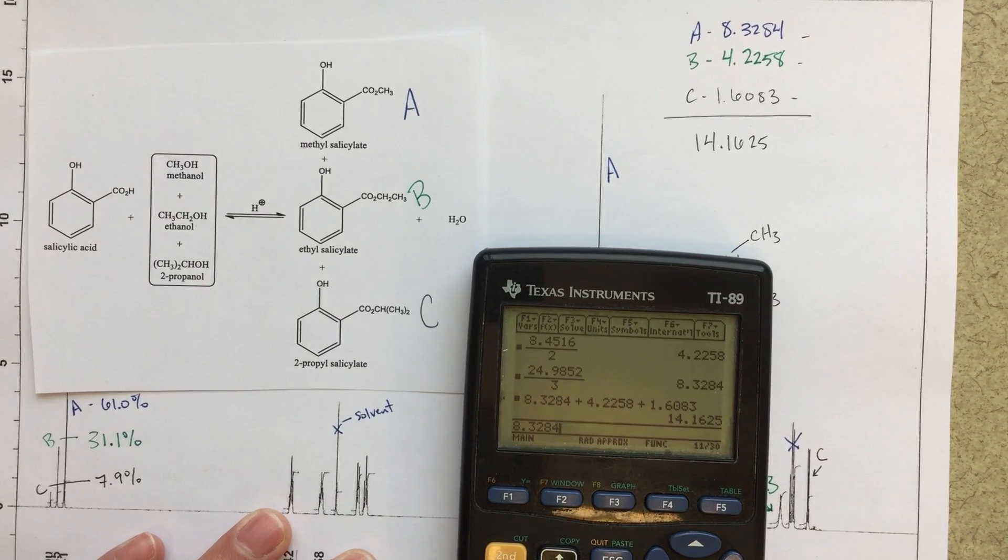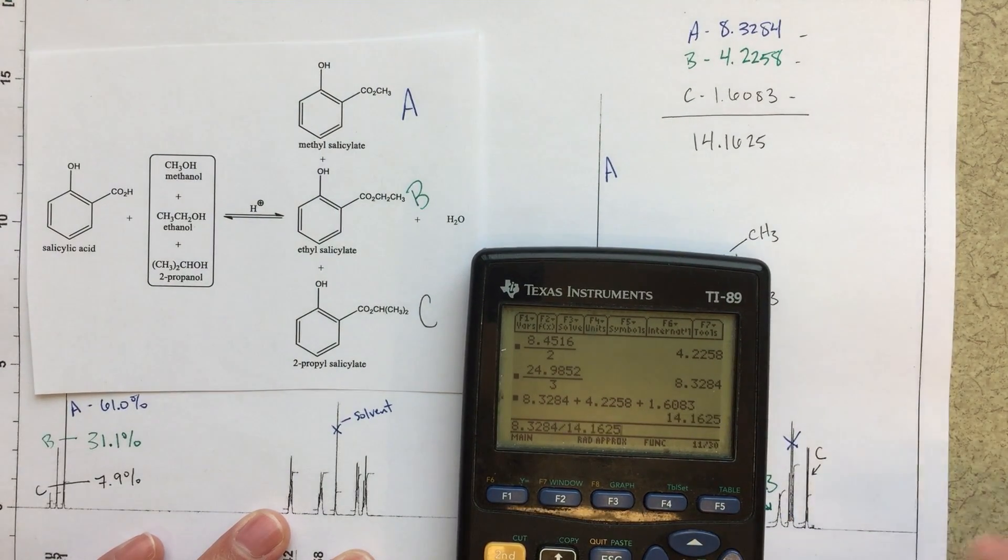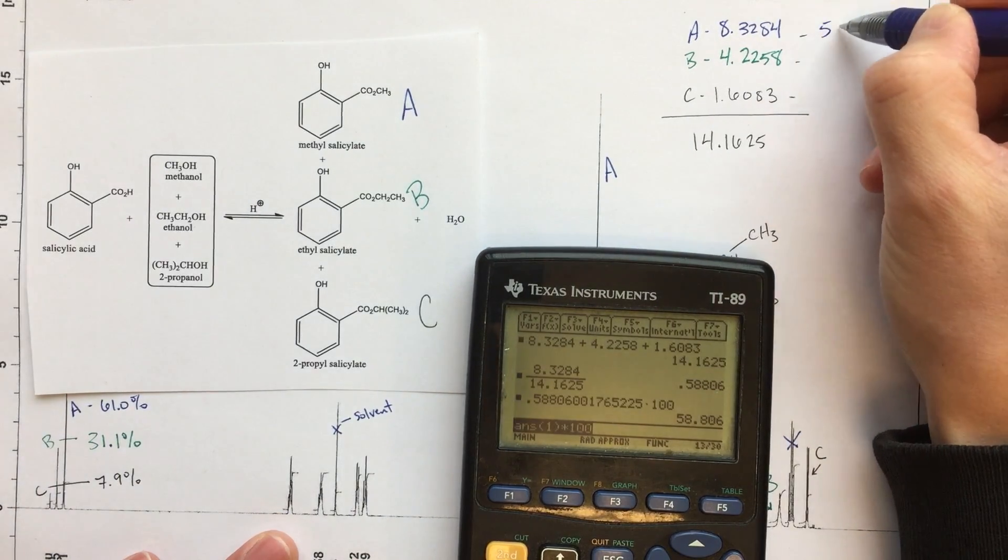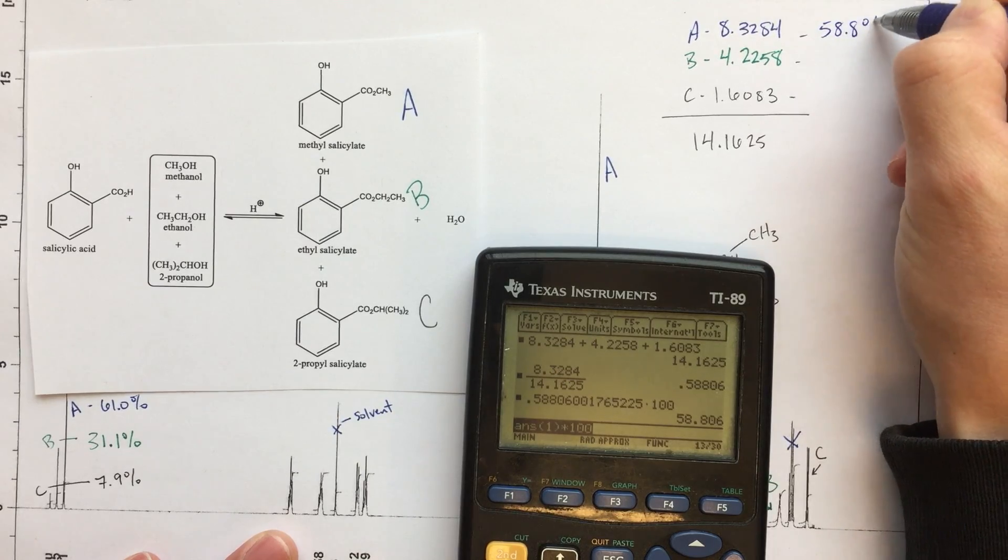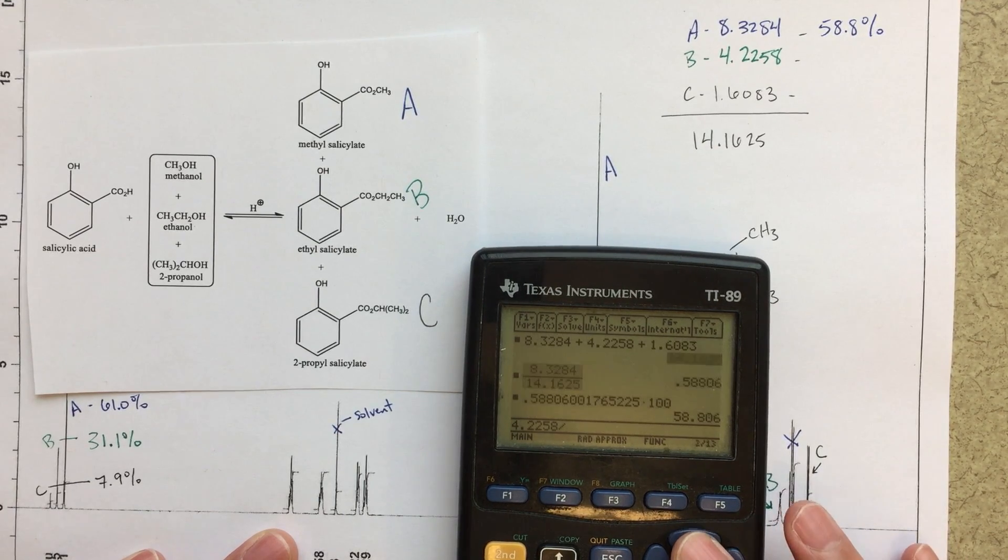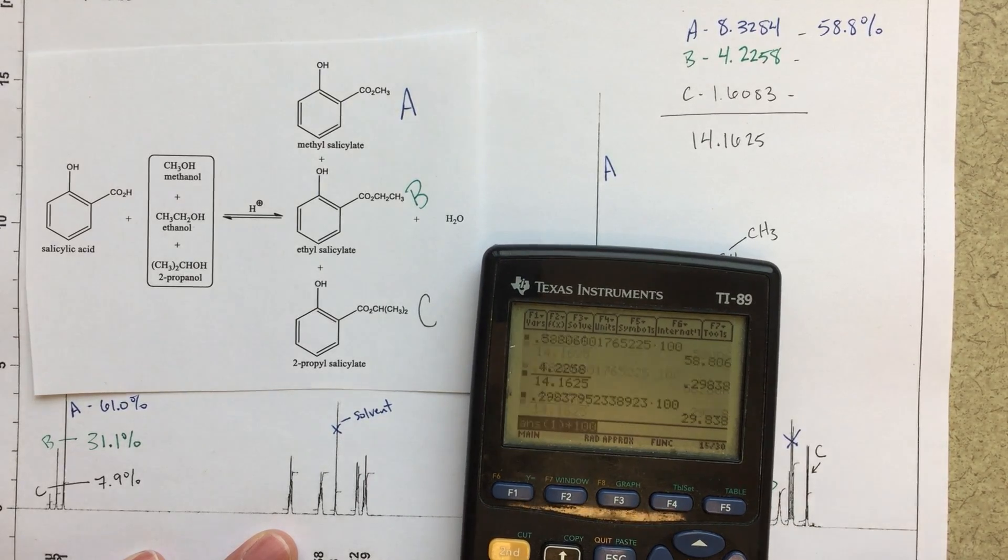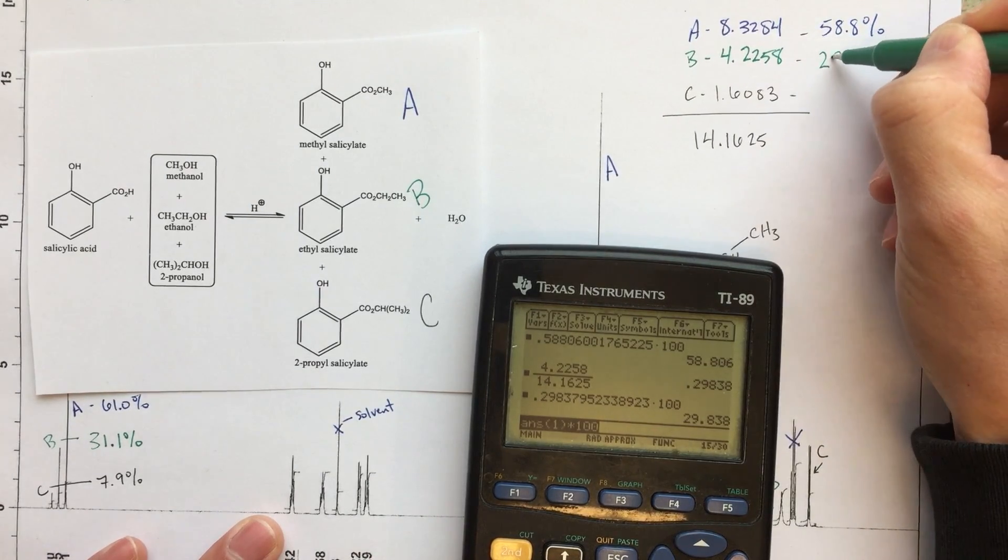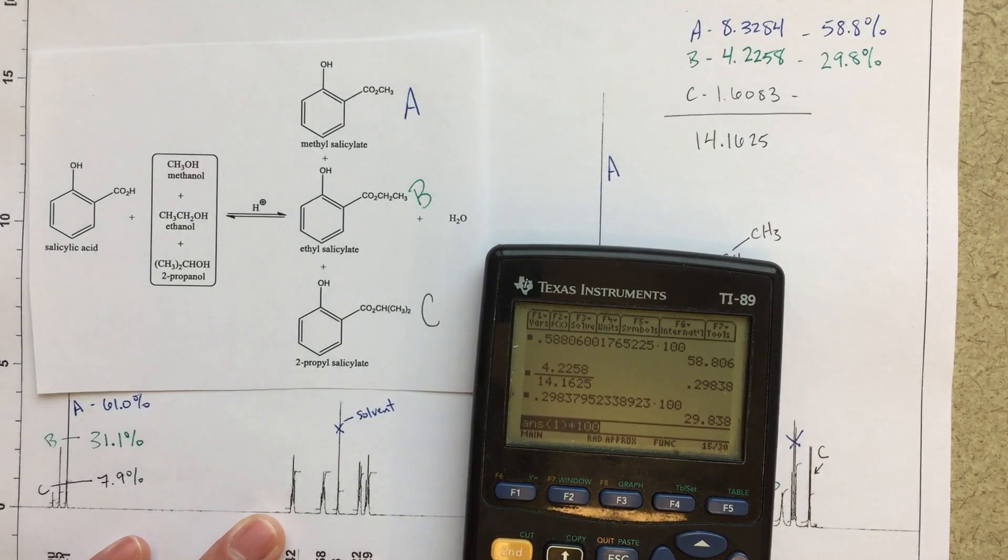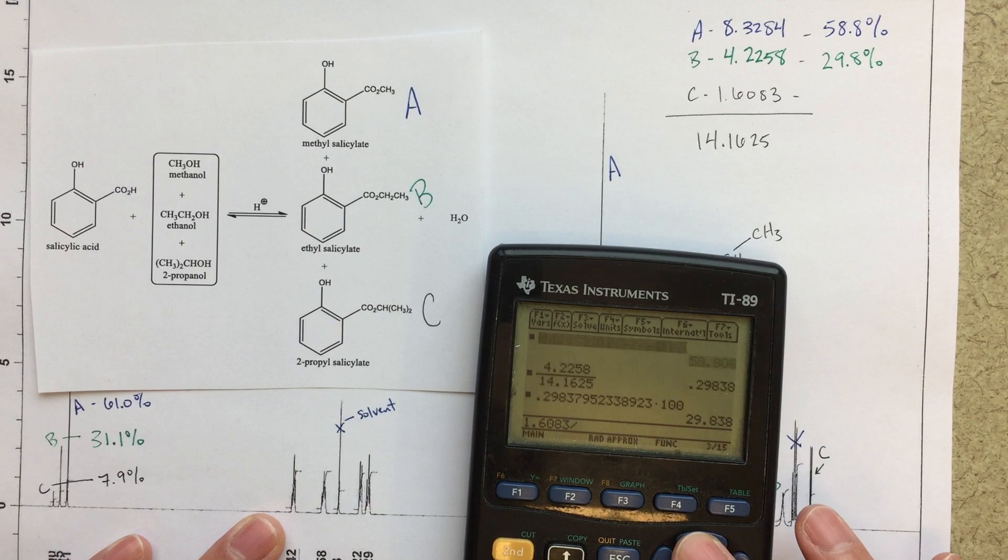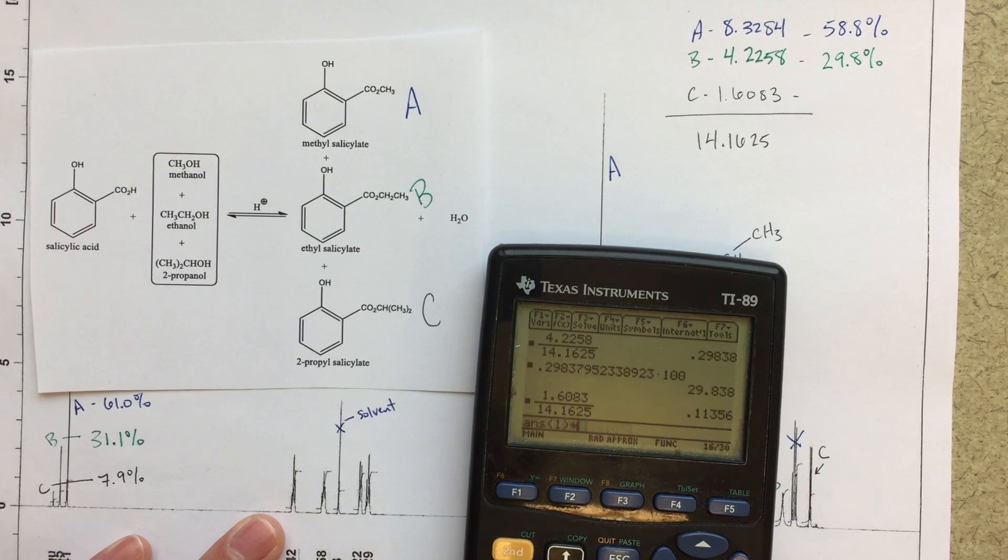So 8.3284 divided by the total, multiplied by 100. And these should be very close to what we saw before, 58.8%. We'll do the 4.2, the B next, divided by my total. We've got, we should keep the colors all nice, 29.8%. And then for our last one, 1.6083 divided by my number times 100. And we end up with 11.4%.